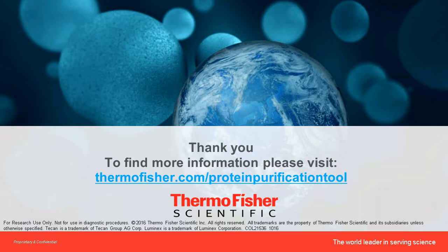If you look at which technique is the most commonly used, it is Western blot. Western blot has been heavily used over the last 3-4 decades for validation of any protein targets. The cost for Western blot will come out to about $2 to $3 per sample.